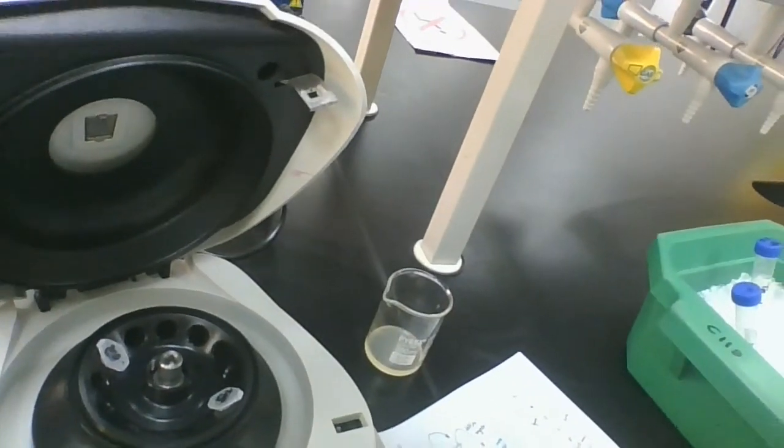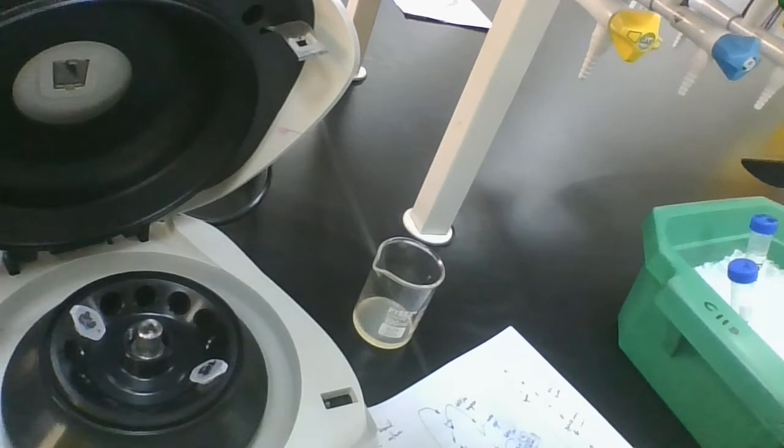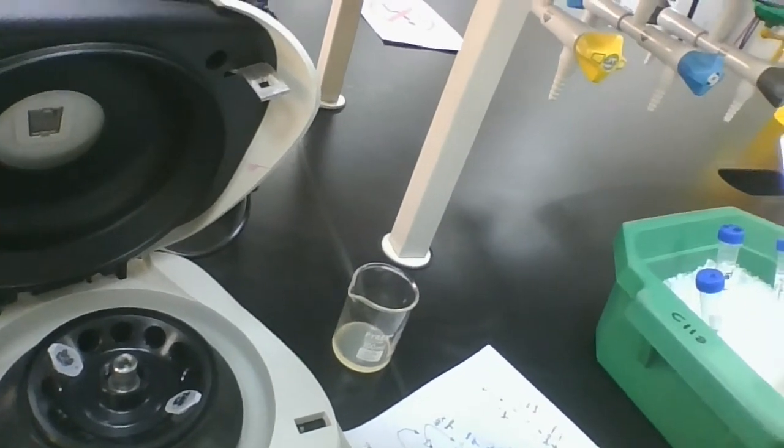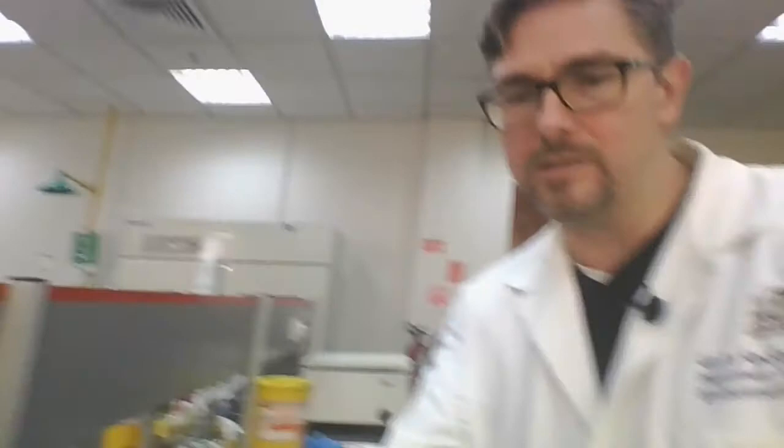Okay. What that's going to help me do is later on, if you do this as a habit, you're going to always know where to look for your pellet, because the pellet is always going to be on the same side as the hinges. Okay, so that's a tip from a molecular biologist to the rest of you. Always know where your hinges are, or at least always stick your hinges out to the outside so that you always know where to look for your pellet. So I'm going to lock this up, and I'm going to spin this for 5 minutes, and we'll see you in 5 minutes.